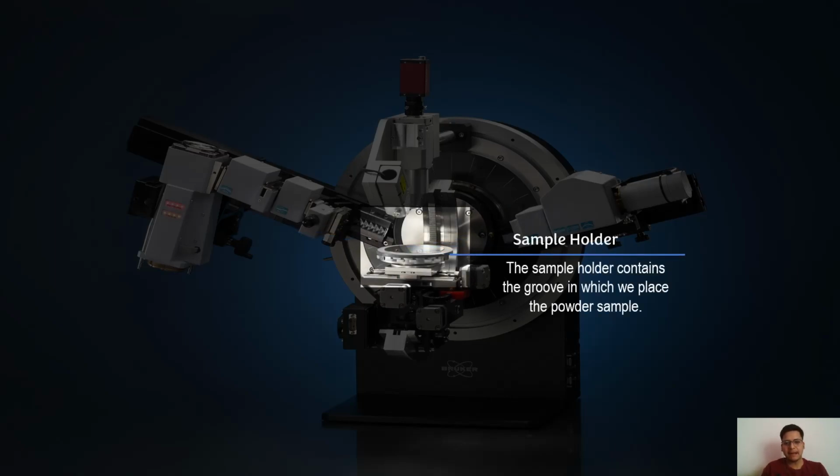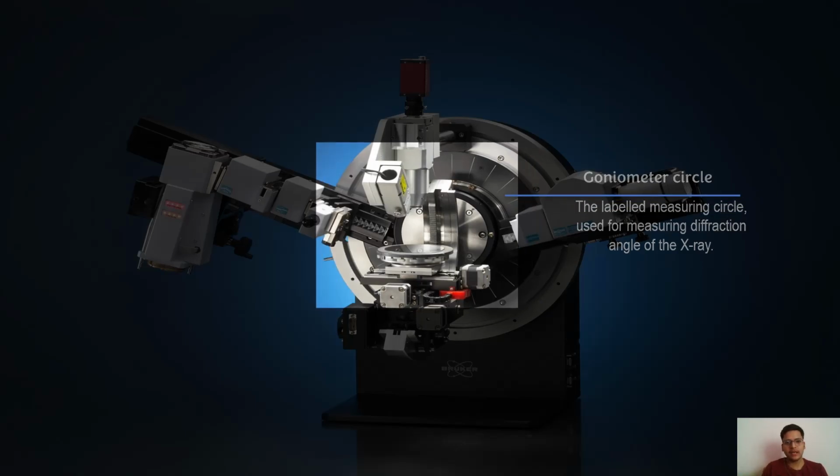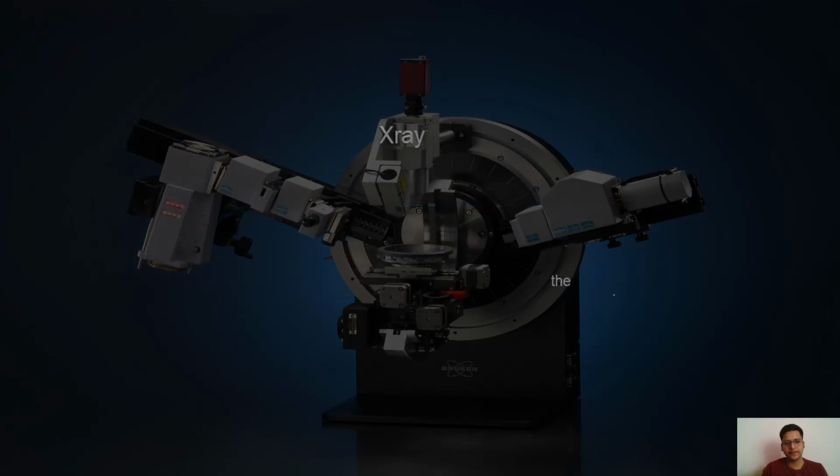The third part is the sample holder. The sample holder is a groove in which we place our sample. Then there is a goniometer circle that tells you how much angle you are going to measure, which is also the diffraction angle. The fifth one is the X-ray detector. This detects the incoming radiation from the atomic planes.